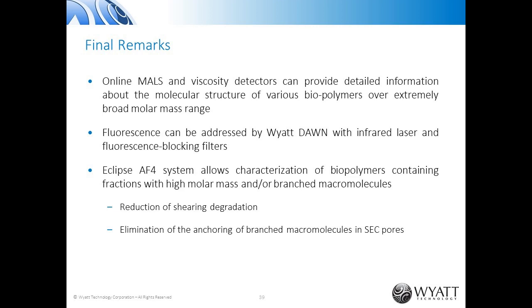Another advantage of the Mark-Houwink plot is that it can also be used for smaller polymer molecules, whereas root mean square radius can be measured down to about 10 nanometers, which is roughly 100,000 gram per mole molar mass, and below that cannot be measured.